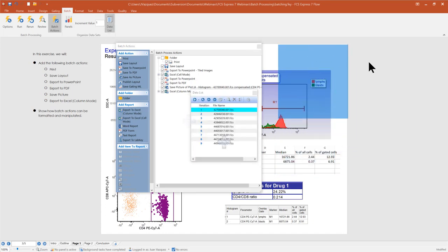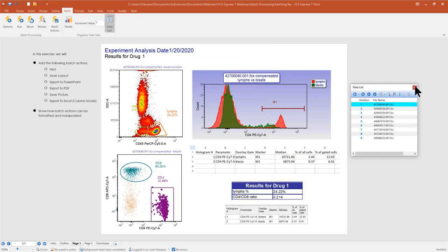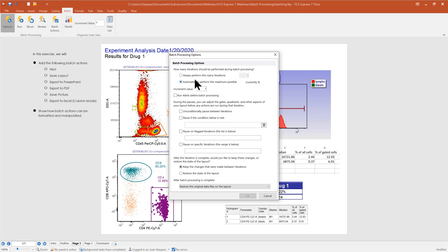Our data list shows nine iterations that we're going to play through this template. From the Batch tab, next to Batch Actions, there's an Options tool. Here you can define the number of iterations to analyze — currently nine. For clinical customers, if you have alerts set up in your layout, you can have FCS Express run those alerts before batch processing begins.